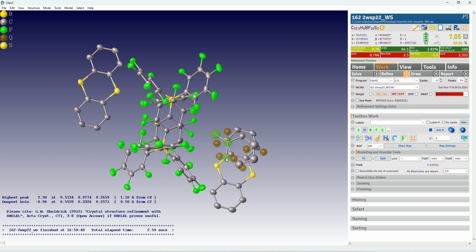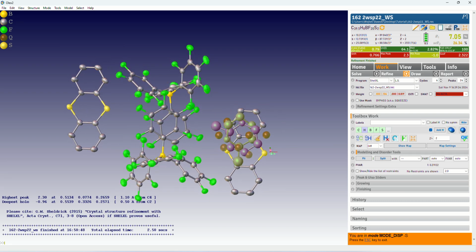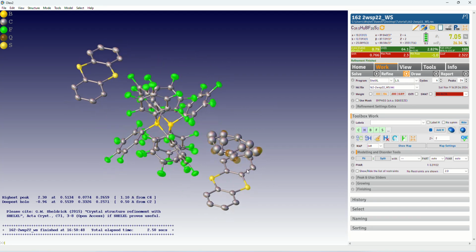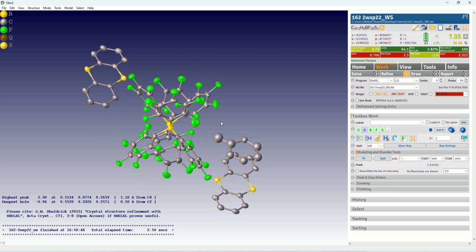I can now click on the atoms we want to split. Split! And now we can try to fit them. So I think it's something like that, right? It kind of matches. If I now keep pressing shift, you can shift the molecule, and escape, right? And great. So if I do now show P01, I can see now the part 0 and part 1.